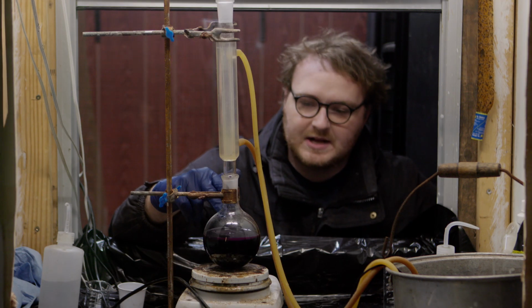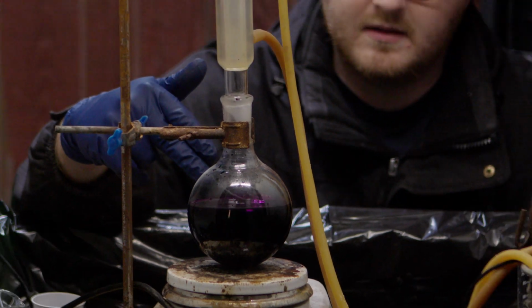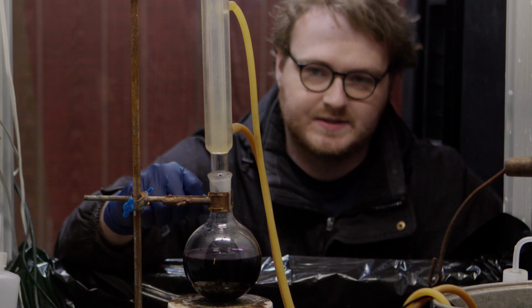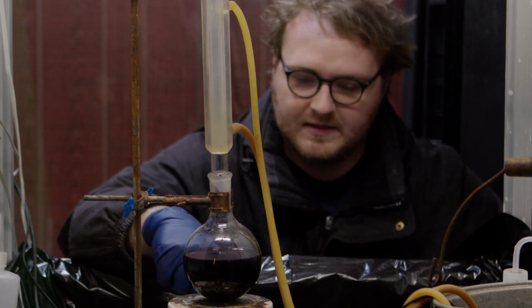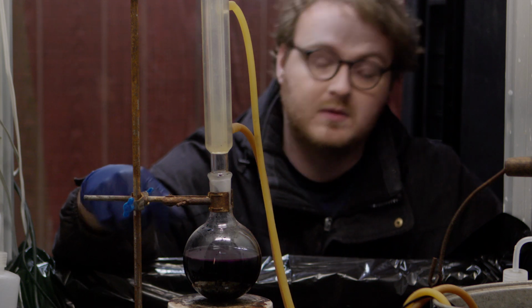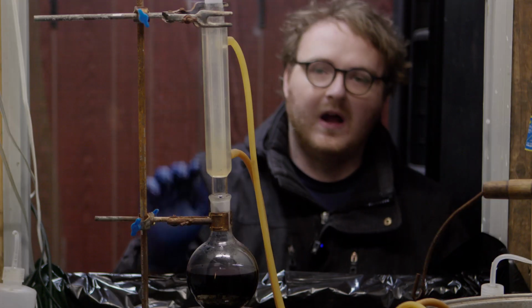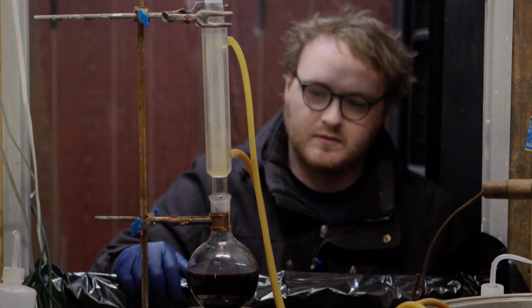Now, one of the problems with this reaction is that the toluene floats on top of the water, as you may be able to see, and that's not good because the reaction is only happening at the thin little place where those two layers intersect. So we need to add plenty of stirring in order to get this to run as we want it to. The more stirring, well, to a point, the more stirring the better. Now in this case, the water is a solvent and the sodium hydroxide is sort of important for the reaction.